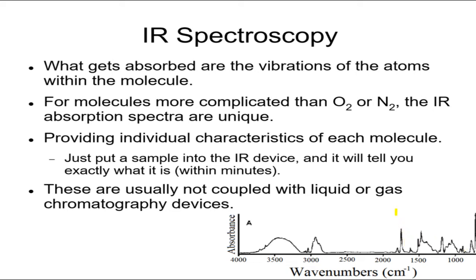So what we do is we have a whole table of all our thousands or who knows how many, even millions. I don't know how many we have. I think we got into the millions, but I'm not sure. Anyway, we have a whole table of where the bands are and how big they are and relative to what. So when the IR signal gets into your sample, it'll produce this. Rich with information. We can certainly look at this fingerprint region and say, hey, that looks exactly like this item in the table. That I know is heroin.